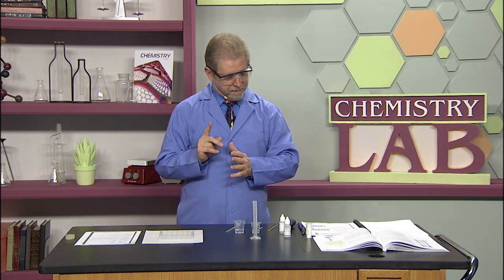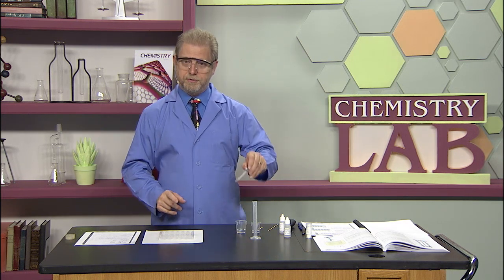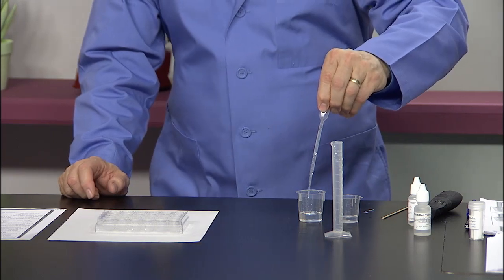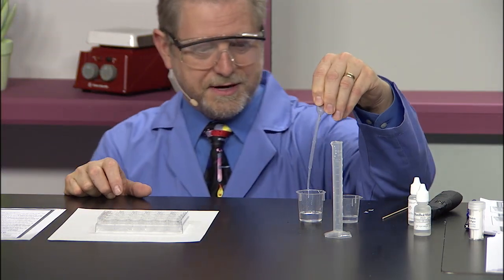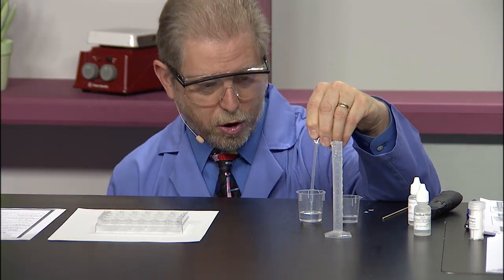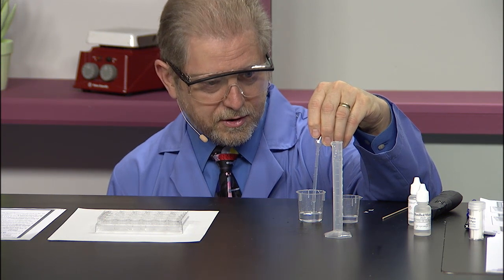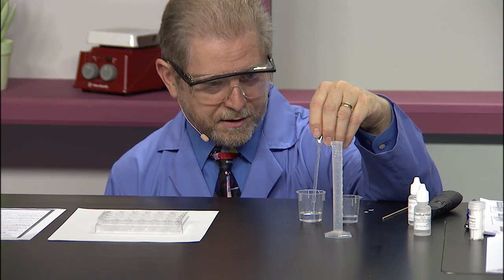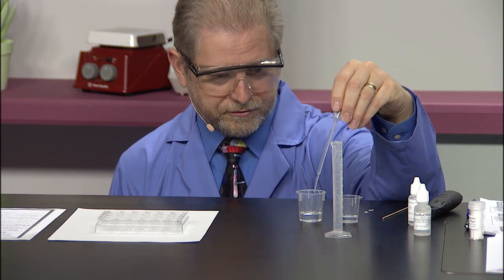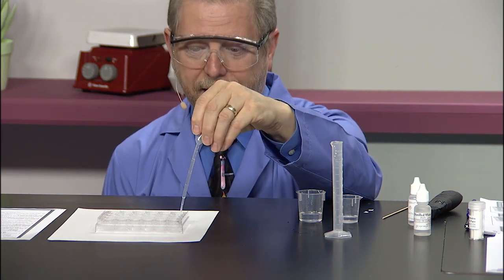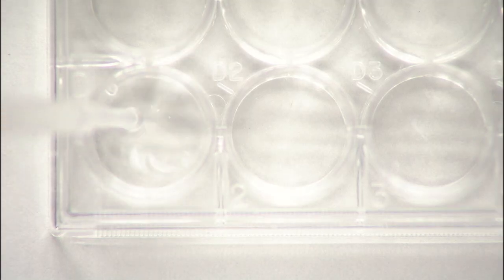The next thing we want to do is take one milliliter again using the same pipette and put it into well plates D1 and D2. Since I'm only going to do this once, I'm just going to put that into well D1.